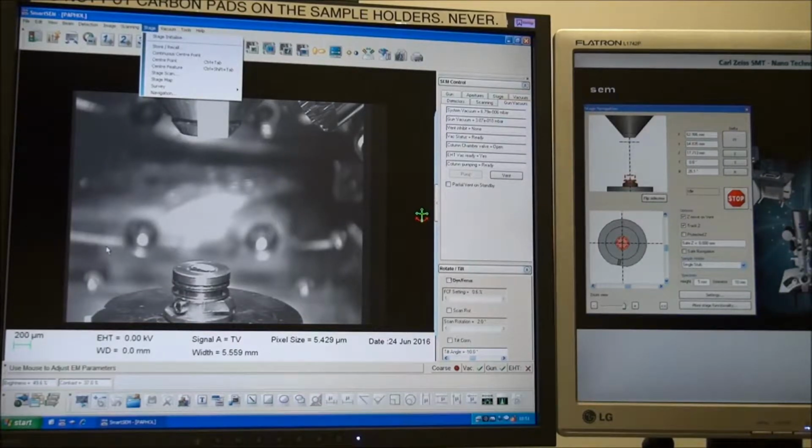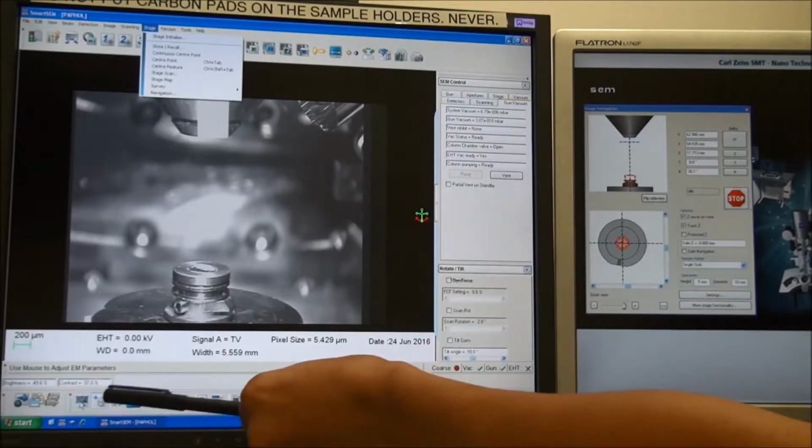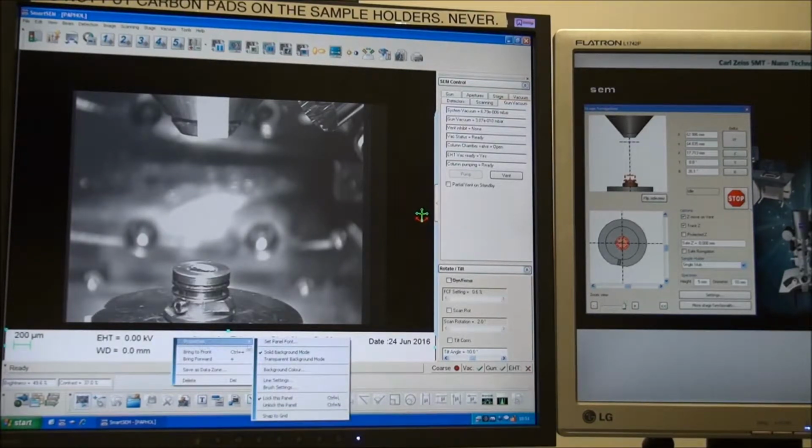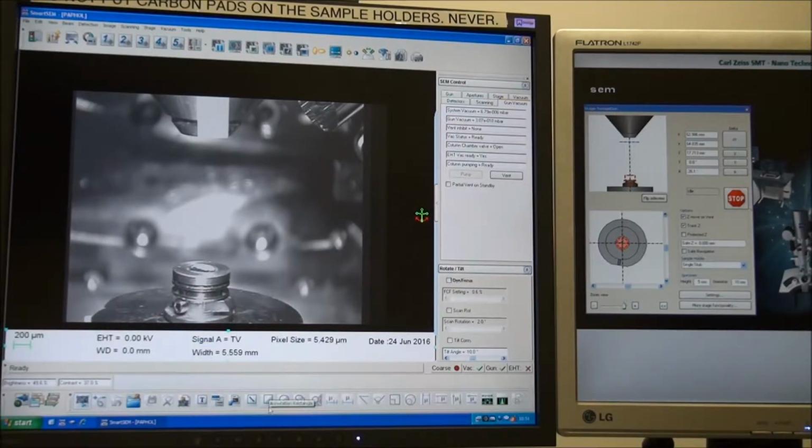First, click on Select Annotation Object over here at the bottom, and then you can click on the Datazone, right click, Properties, unlock this panel. So now you can select individual objects inside the Datazone. For example, if I don't want the pixel size, I can select it and then press delete on the keyboard.